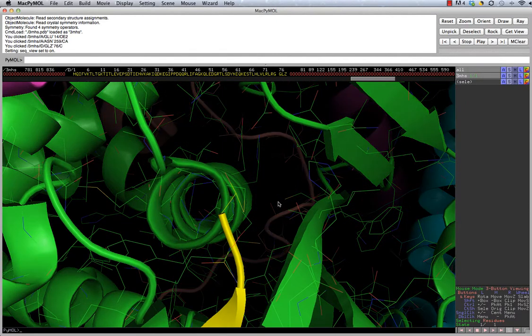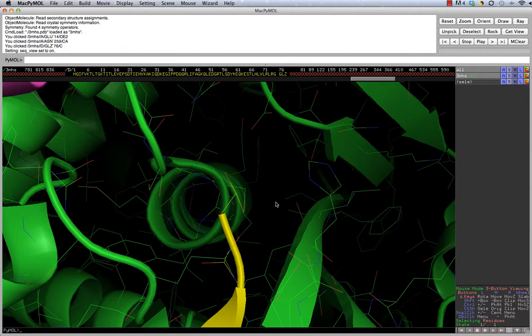And by manipulating the wheel, and just play with rolling it up and down, the slab either increases or decreases. So on my mouse, I'm rolling the wheel sort of away from me, and you can see it's limiting the number of residues that are being shown in view, and it's also increasing the depth cueing, which basically makes things look darker the farther away they are from you.